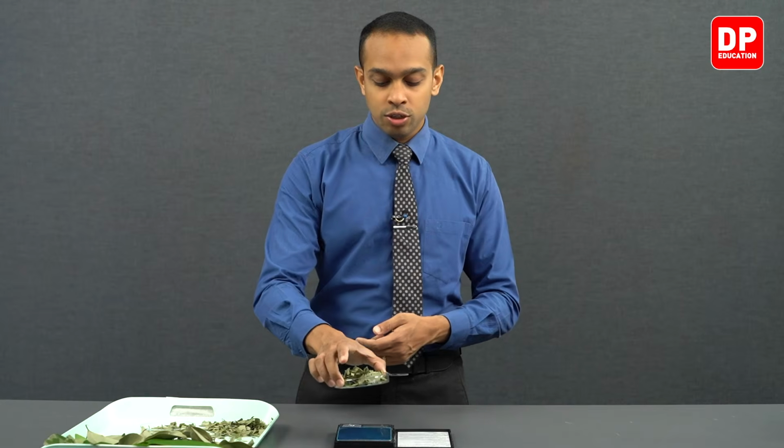We can transfer this amount of cinnamon leaves into our round bottom flask now and move on to adding 50 milliliters of water. Although we have measured exactly 5 grams of these cut pieces of cinnamon leaves, we might need more than 5 grams to obtain a substantial amount of cinnamon leaf oil.